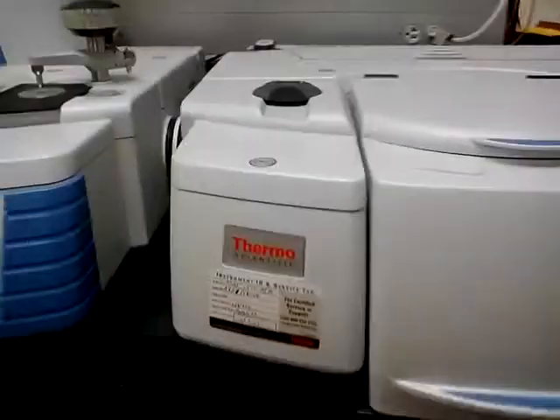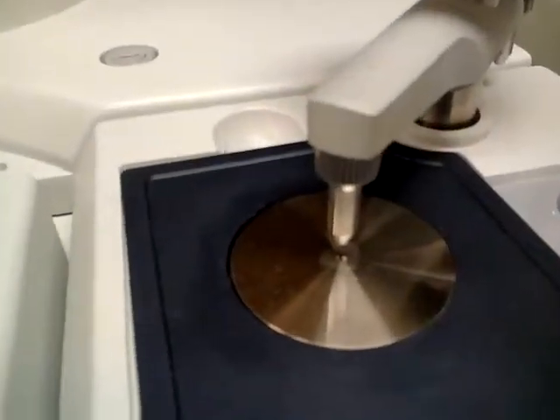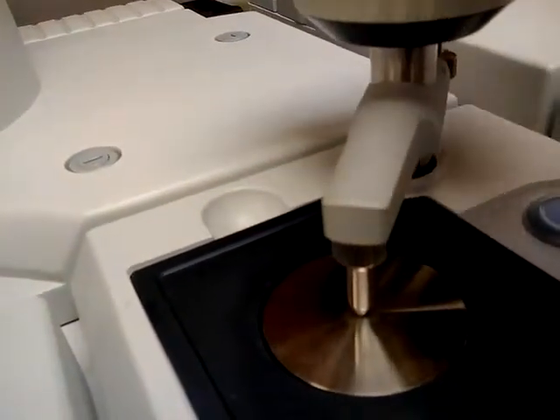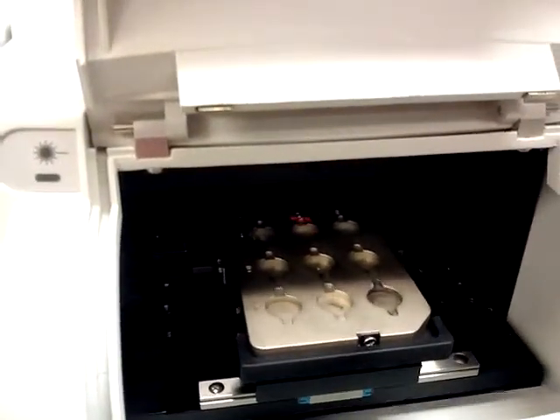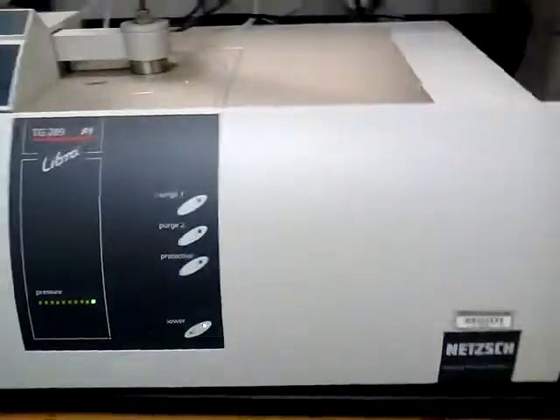IR. Okay, special attachment. All right. FTIR. Put some crystals right there. Test them out. See what they're doing. Okay, what are you?